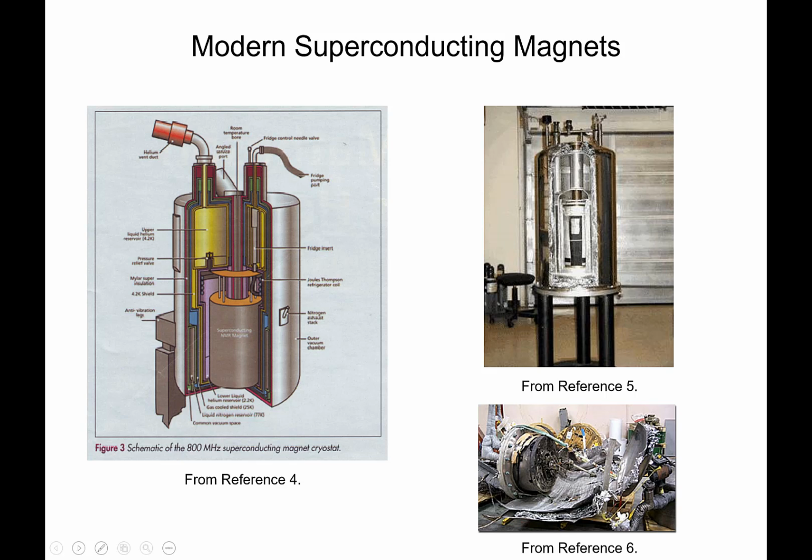This is called a superconducting magnet. We use superconducting magnets now. So in physics, you talk about superconducting materials. Superconducting materials are materials that, when you apply current to them, generate a magnetic field, but if they're in liquid helium, there's no resistance. So once you put the current into it, the current just keeps going around and around as long as the material stays in liquid helium.